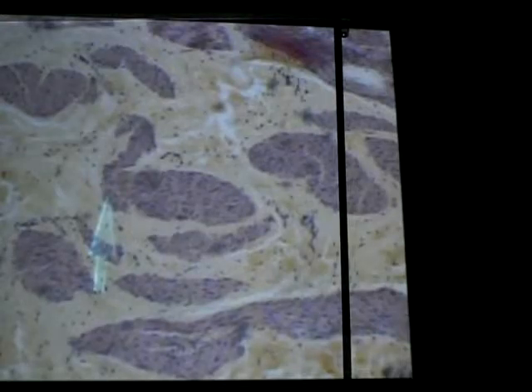And in the bladder, the wall is much thicker than you see in your ureter. And you're going to have a lot of smooth muscle present in the walls. So notice you have this very thick wall. It has about 3 layers of muscle that's surrounding the lumen. Alright, so you have a lot of smooth muscle, very thick wall, and you have your transitional epithelium. Alright, so that's going to be your bladder.